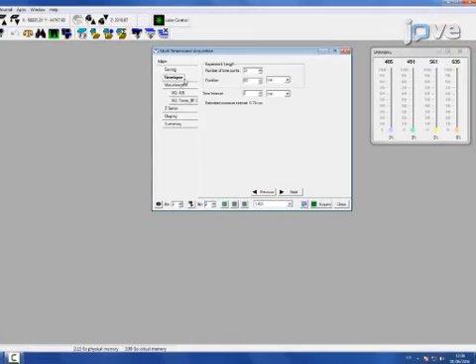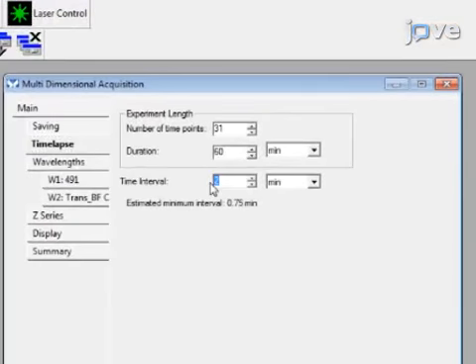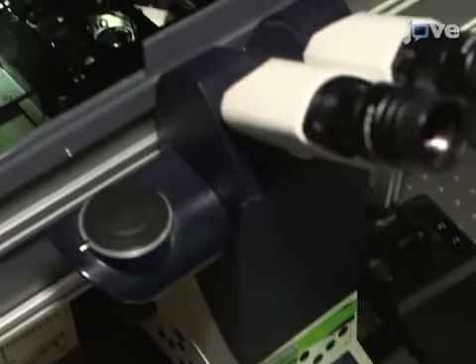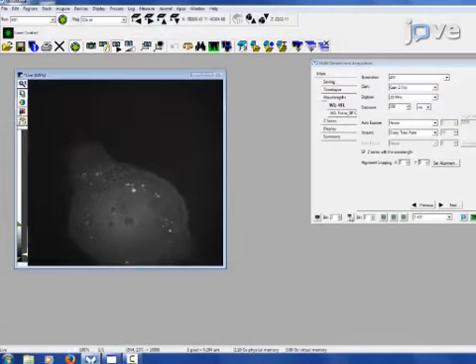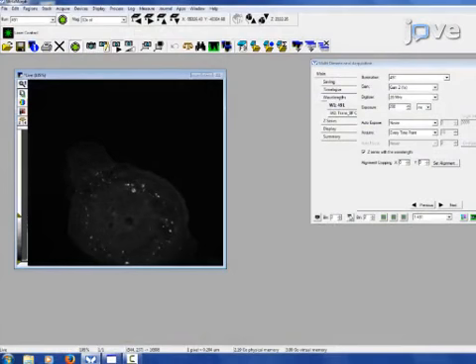Optimize the imaging settings such as scanning speed, magnification, resolution, etc. to have at least one cell per field and to image one frame every minute between 60 to 120 minutes. Place the imaging dish on the microscope stage. Adjust the focus and the location to find only one whole HIV-1 infected macrophage in the field.